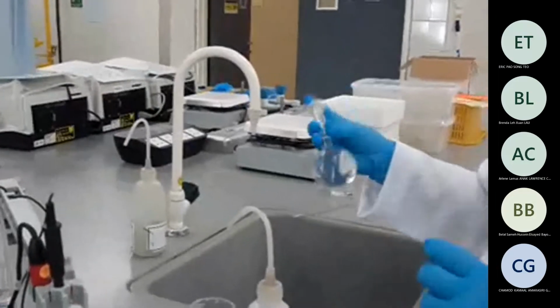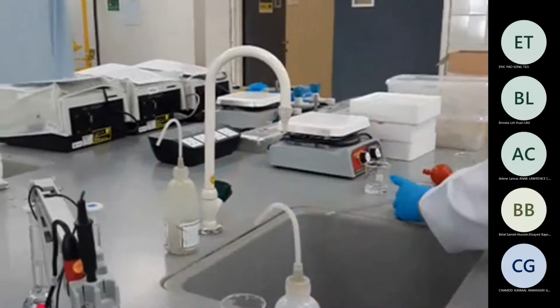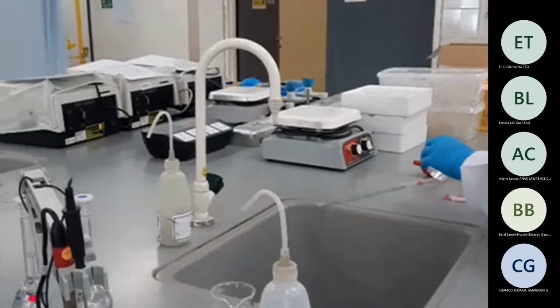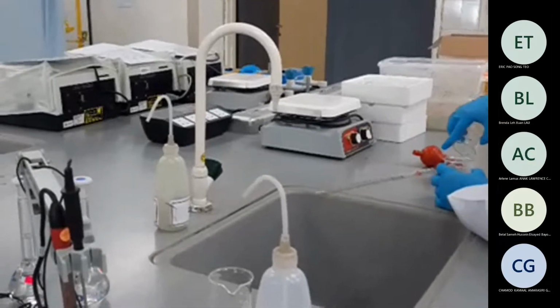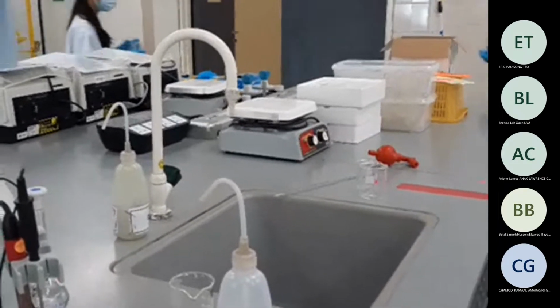So Lynn, are you done? Both of the solutions done, yeah? Preparing? Okay. Yeah, so you don't need those two beakers anymore. So just discard those in the waste bottle and then bring the beaker. We need the beakers. So later on, you need to wash it with the tap water and then rinse it with the distilled water.